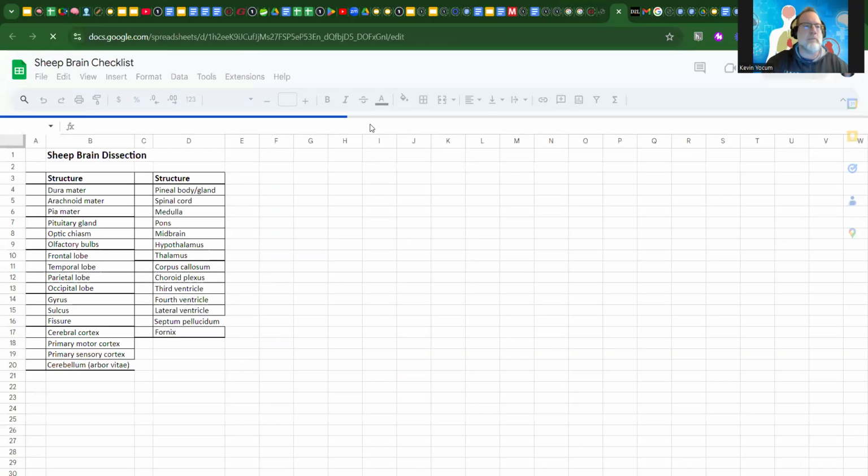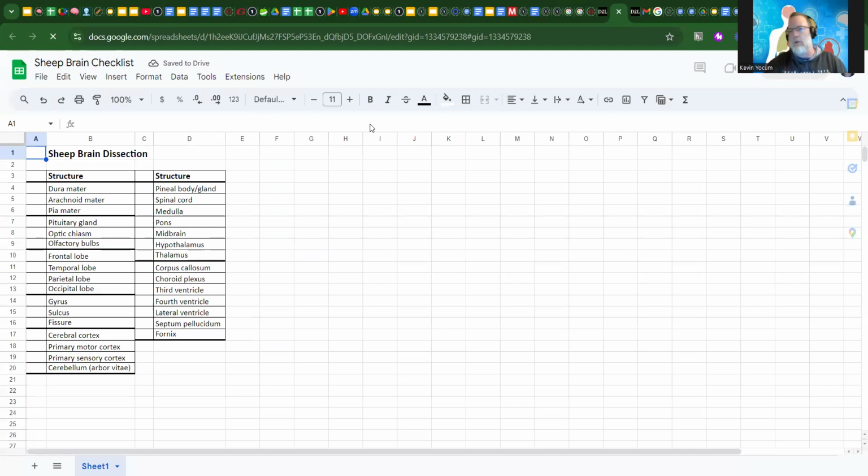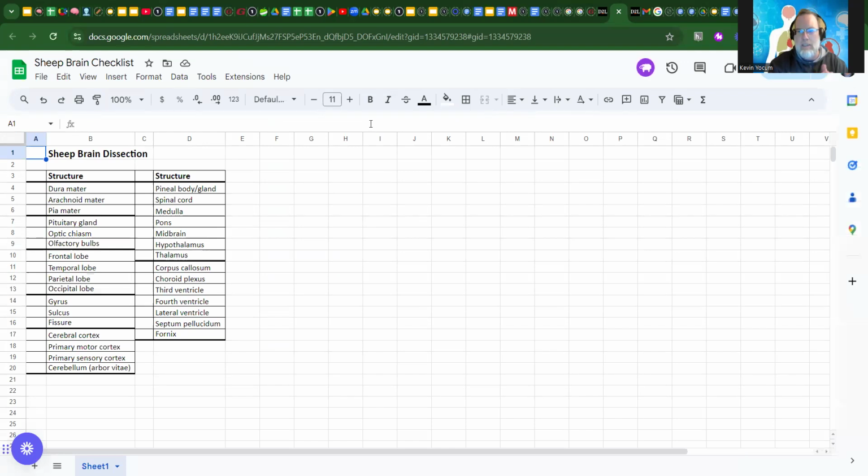Some of you have possibly dissected a sheep brain. I know I'm teaching a high school freshman biology class this semester, and several of them in middle school dissected a sheep brain, I think in 8th grade. And I'm like, wow, cool. I took an A&P class in high school, anatomy and physiology, and we didn't do anything like that, let alone in 8th grade. So if this is repetitive or redundant, consider it a review. But here are the primary structures that we're going to look at.